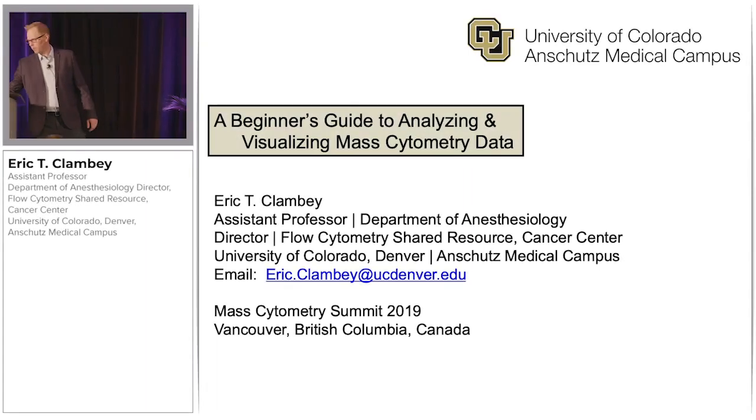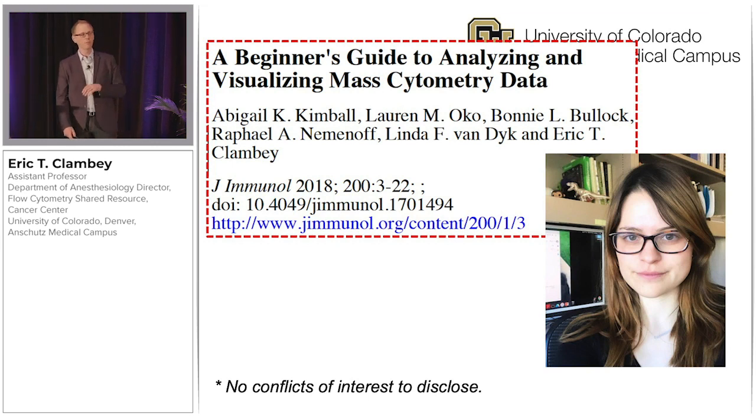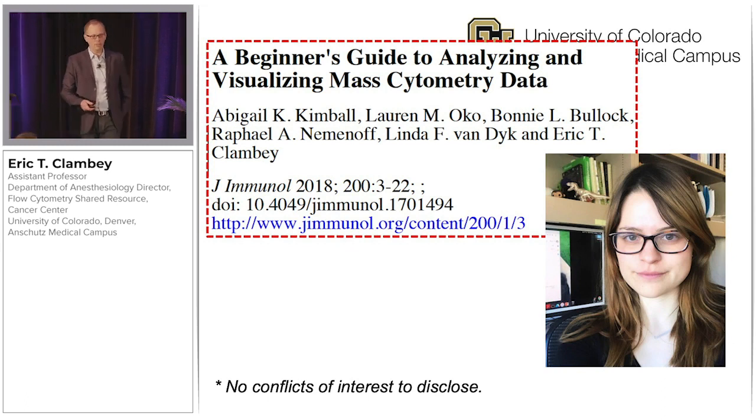So today I'll present a perspective: a beginner's guide to analyzing and visualizing mass cytometry, or CyTOF, data. This talk is really built on our publication in the Journal of Immunology last year, a paper strongly driven by Abby Kimball, an amazing researcher in the group. And this paper was really triggered by our experiences getting into CyTOF analysis.